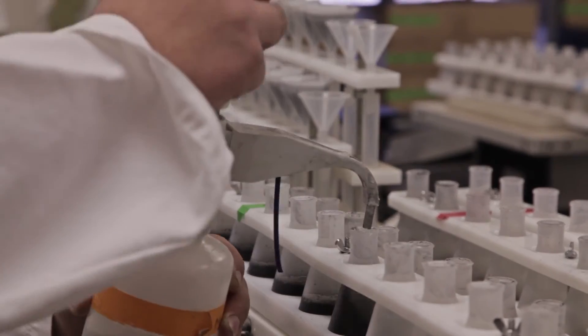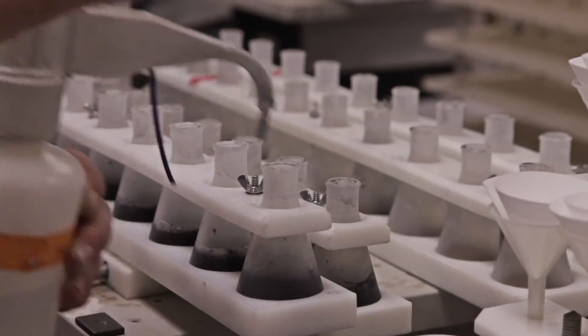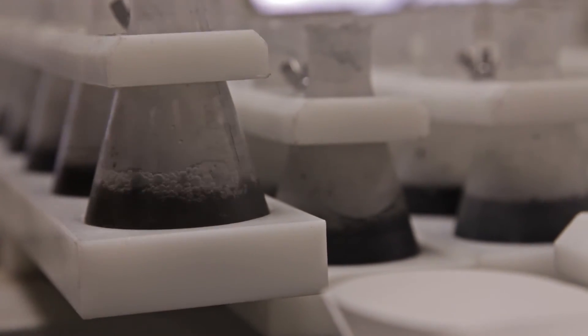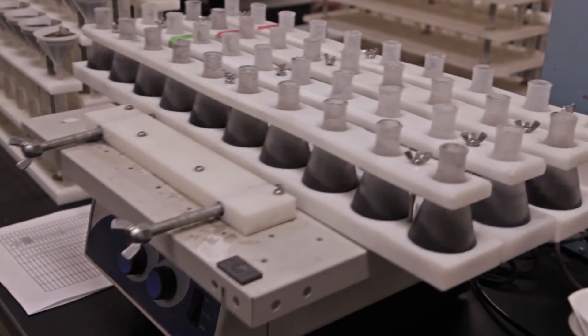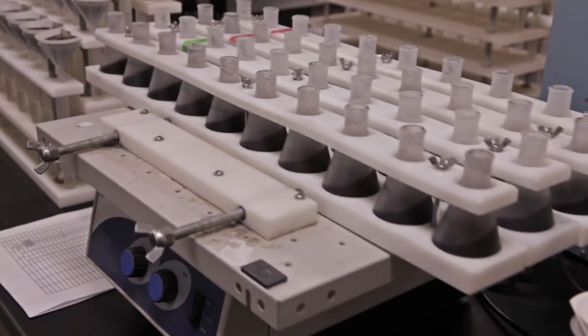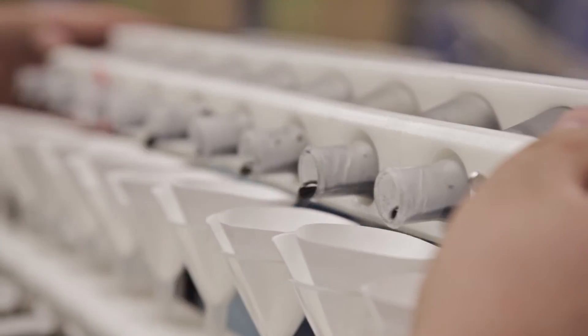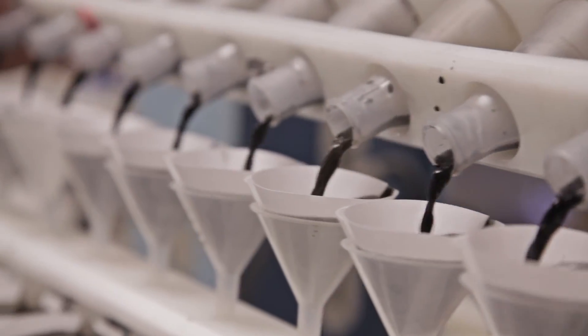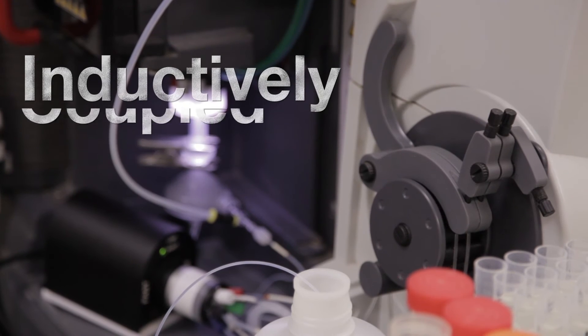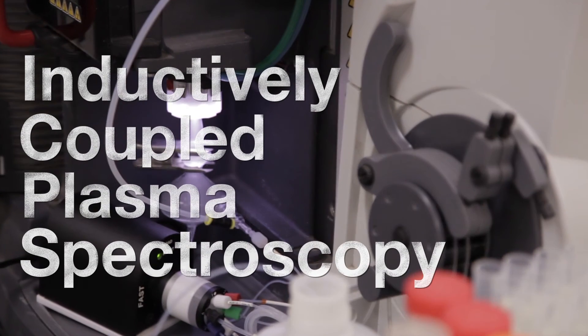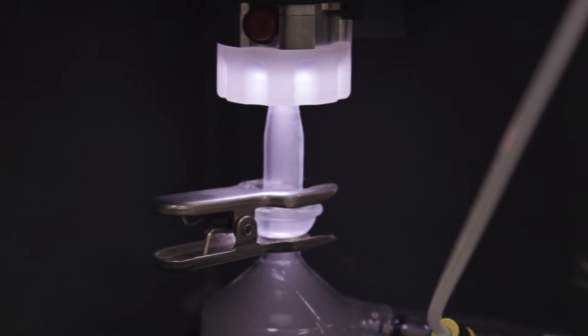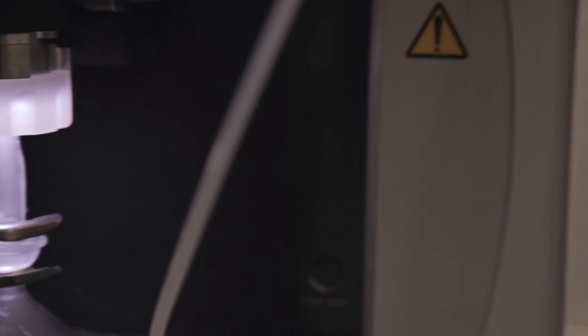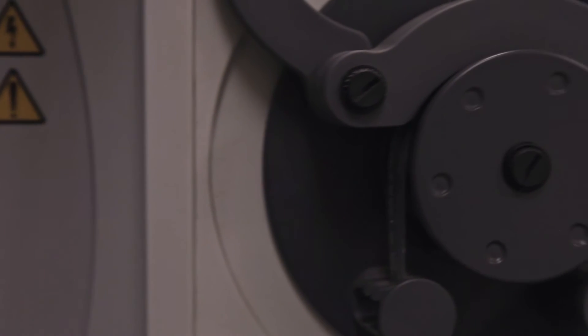We put a portion of the soil in an Erlenmeyer flask, add 20 milliliters of extractant, shake it for 15 minutes, and then filter it. That results in a filtrate that we measure on an ICP. It ionizes everything within the liquid sample and generates different wavelengths depending upon the element we're measuring.